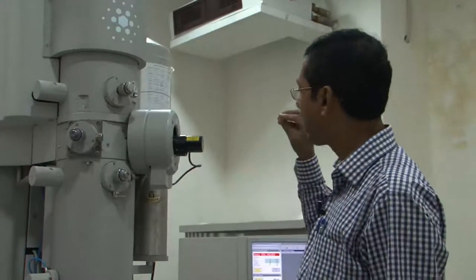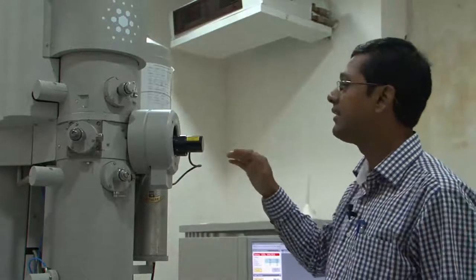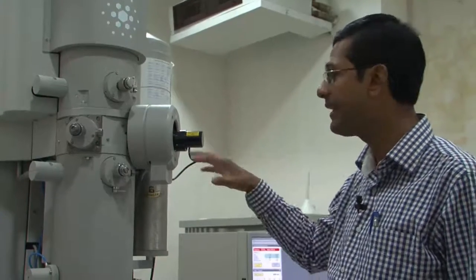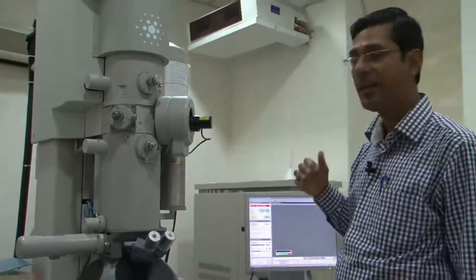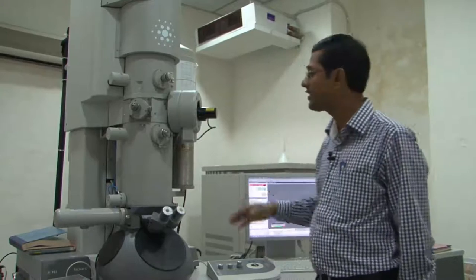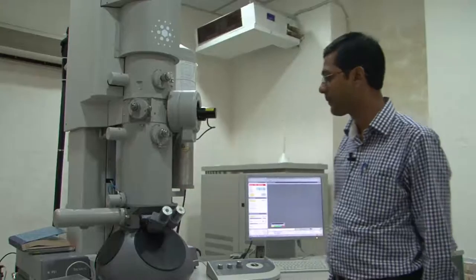lens. The sample is inserted between these two twin pole pieces, and then the beams which fall on the sample are passing through the sample. They are actually focused by the objective lens to either generate an image or generate the diffraction pattern by a set of lenses which are sitting here. They are called intermediate lenses and the projector lenses.